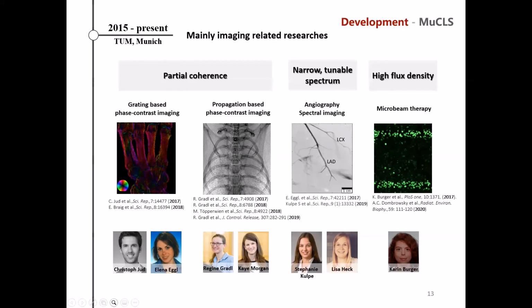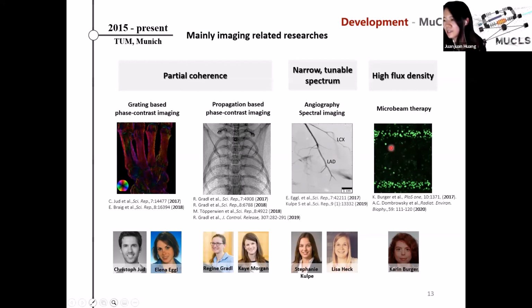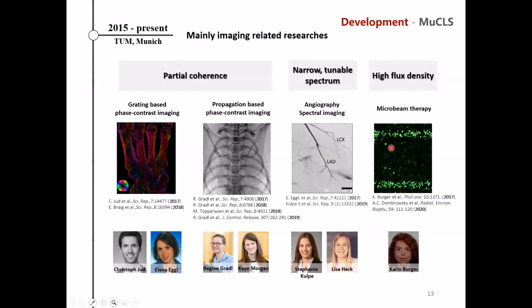To follow up on the previous polarization question: your light is polarized in a certain linear direction. Yes, I think so. So you could do dichroism by rotating the sample. Yeah, I'm not sure whether this is feasible. I personally don't have experience of doing dichroism, so maybe it's possible. I'm not so sure.